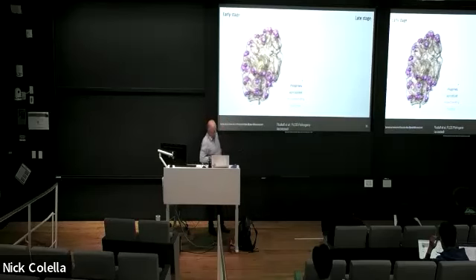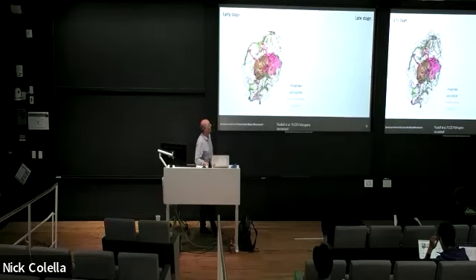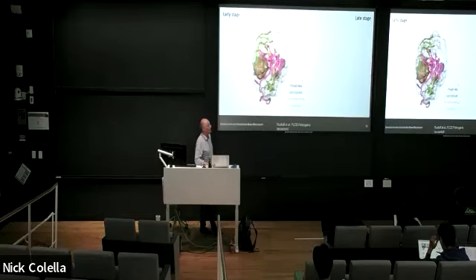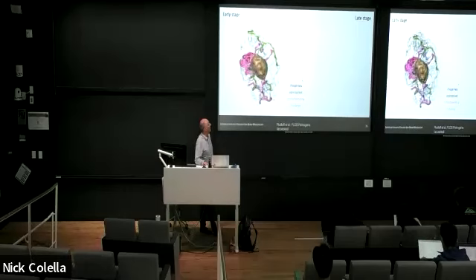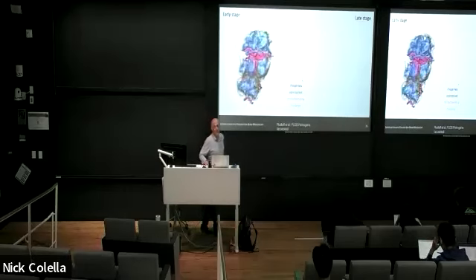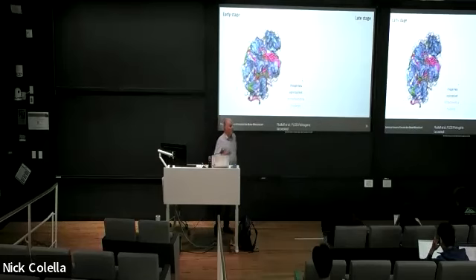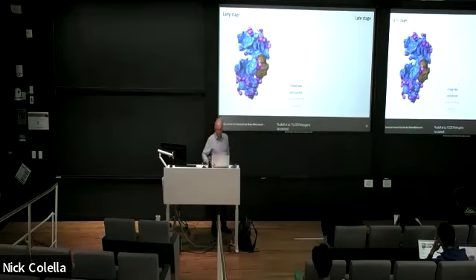And then you can see certain organelles, how they are distributed in 3 dimensions within the cell. And this type of information you would not be able to get with a simple 2-dimensional cut. Right? So here you have the entire 3-dimensional context of the entire cell.